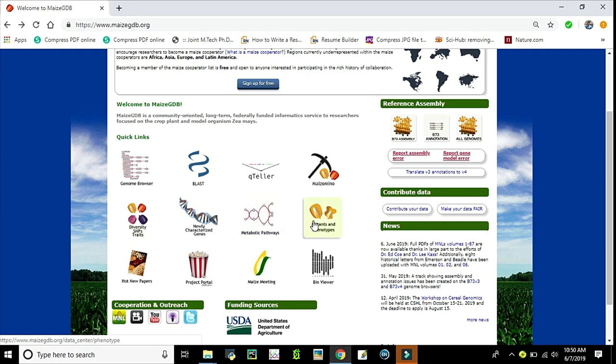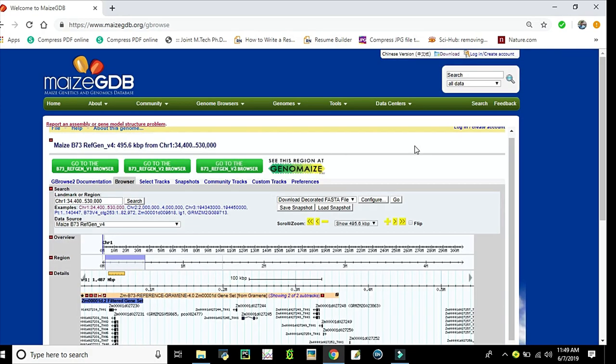Mutant and phenotypes option tools will help you find mutant information. It has a wealth of information regarding the history of maize mutagenesis, high-quality images, and descriptions of many new collection mutants.